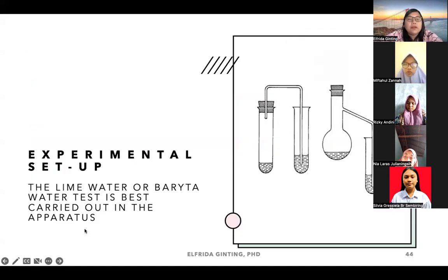Okay, now, this is the experimental setup for the barita water or lime water. For example, you mix the carbonate with the dilute hydrochloric acid, right? And once you mix it, you close the lid, you close the test tube, right?